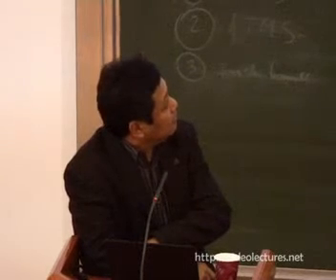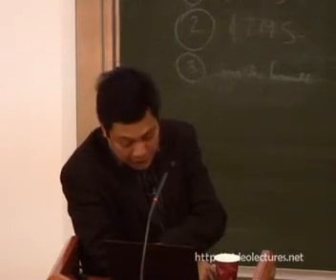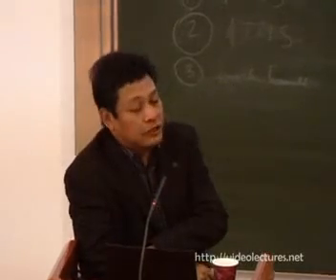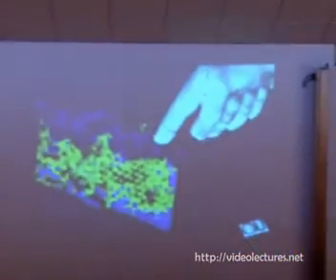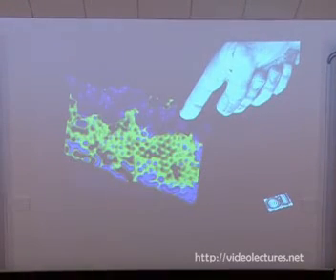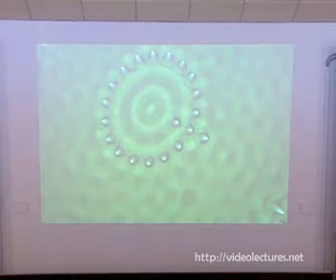Another example is just for fun. So this is now how I see it. We are actually reaching the surface at the atomic scale. So this is how I see it. Instead of an STM tip, we can actually go and touch the atoms, pick up the atoms. We can listen to the sound. We can move the atoms. We can create nanostructures to study special effects.